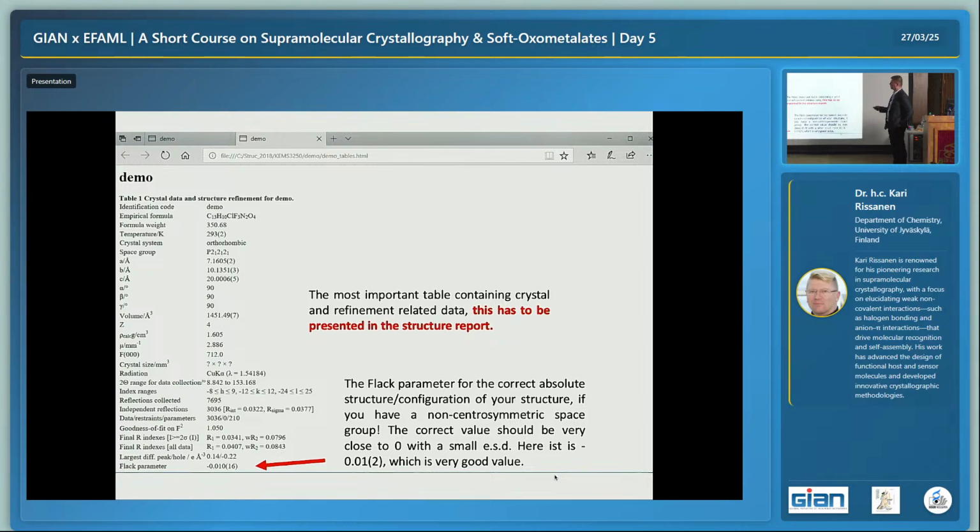In this case, we are very lucky because there were chlorine and fluorine atoms, where the separation of this 002 and 00-2 is big. And the heavier atoms we have, the bigger the differences are. So this calculation is very complicated if we have a hydrocarbon. But it can be done. A very specific technique can be used so that we also have the handedness of a hydrocarbon. But as I said, X-ray diffraction, based on the Flack parameter, based on the difference between data, is the only experimental method where you can say for sure, okay, my molecule is left-handed or right-handed.